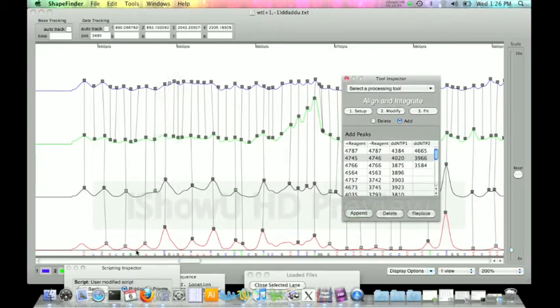Because I see this A here, and I can tell it really wants to be under this peak. So I'm just going to keep adding extra peaks until we can get that A over there. So I'm just going to go ahead and drop this one in there. And there we go. We have our A under our A.